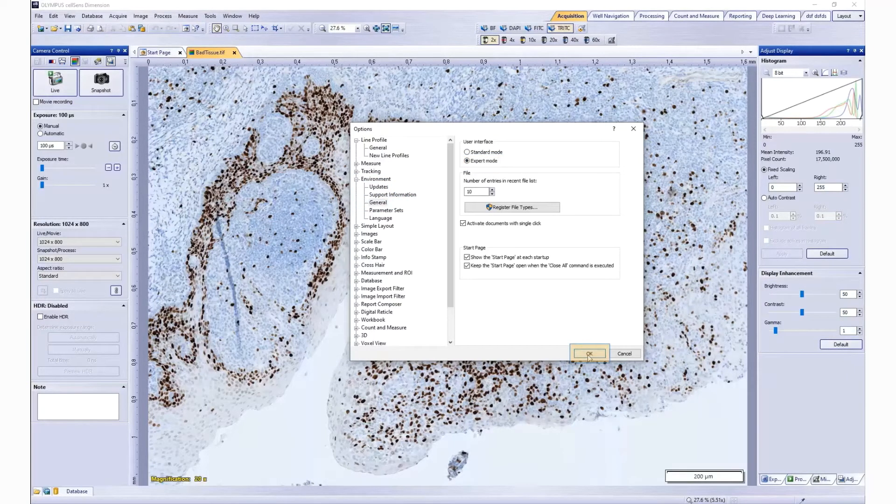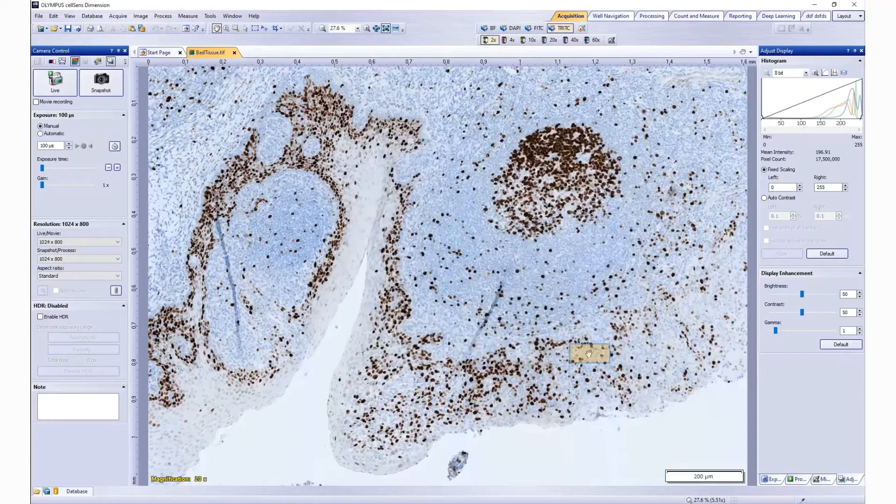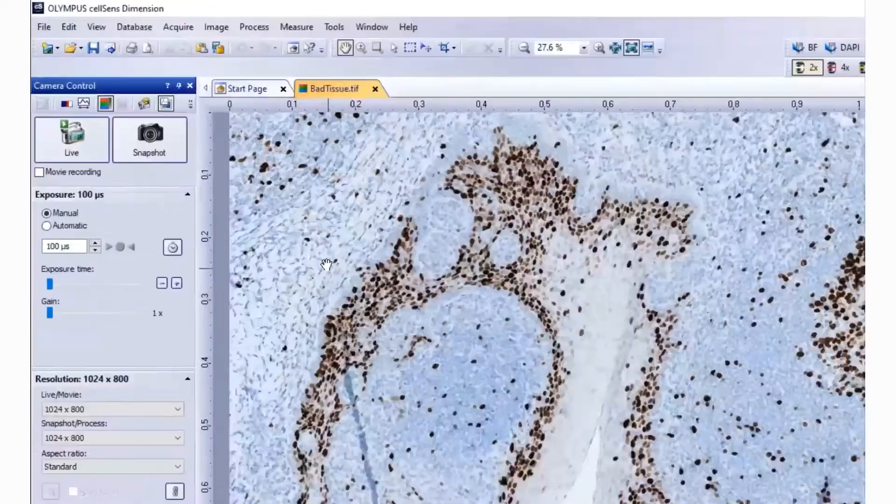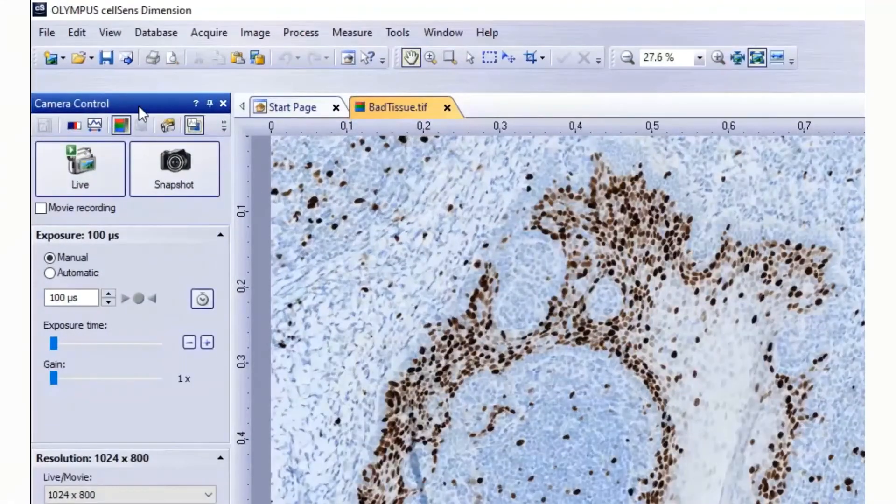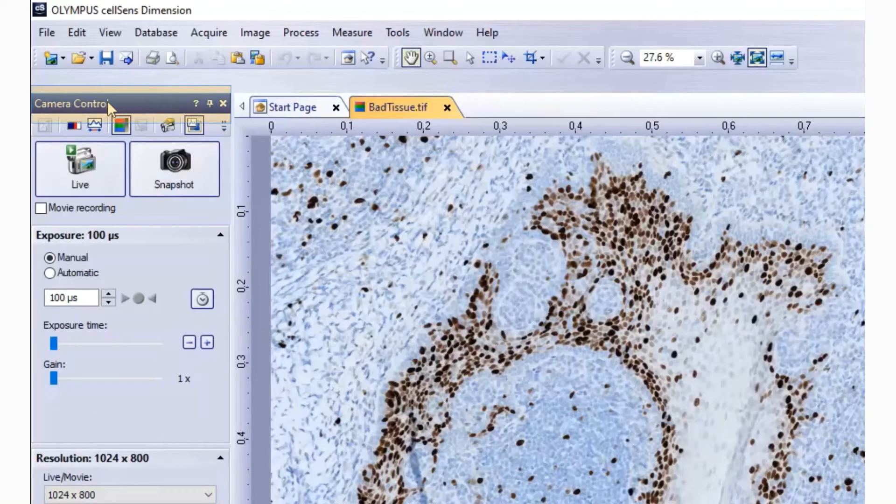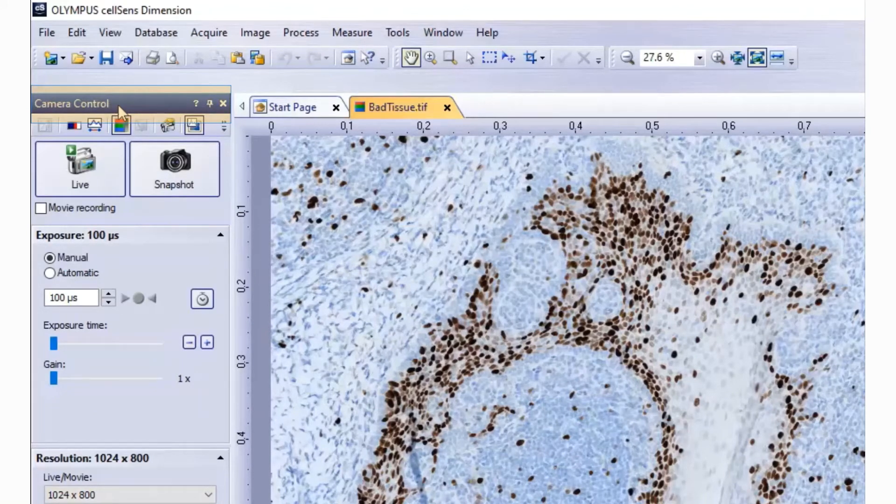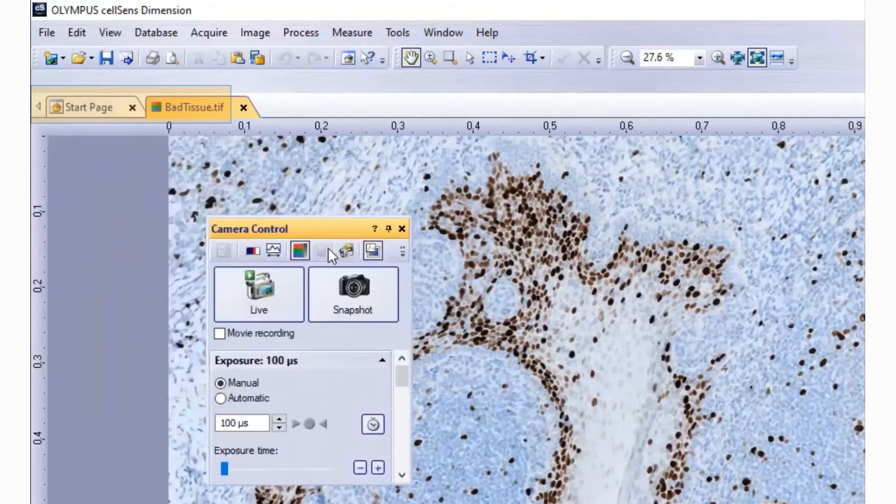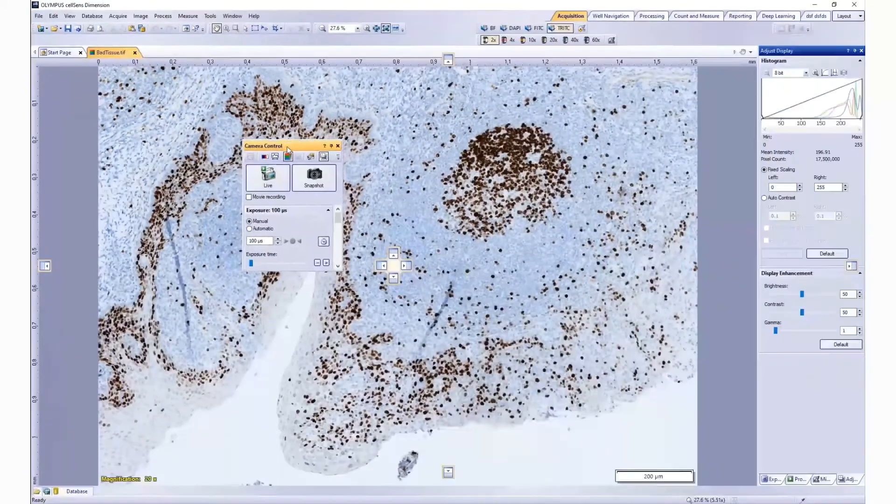Click OK. To move a tool window, click on its header with your left mouse button and hold it. Then drag it out of its docked position.